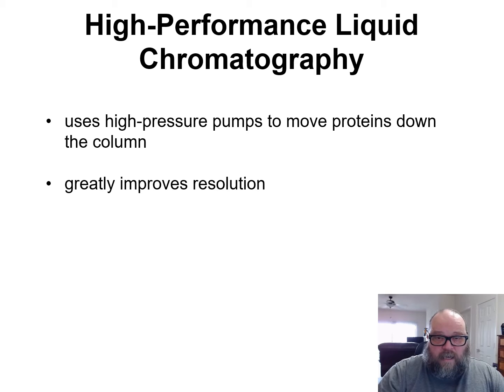Nowadays, instead of letting gravity do the work, like if you did this back in BSc 244, an intro cell and molecular course, you just put it in the top and let it drip out the bottom. That was gravity driven, the weight of the liquid pushed it through. Well, that takes time, okay? Especially since you have to go through a large volume of extract, and you really want to be precise.